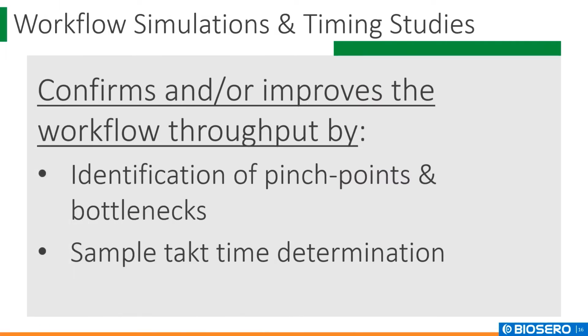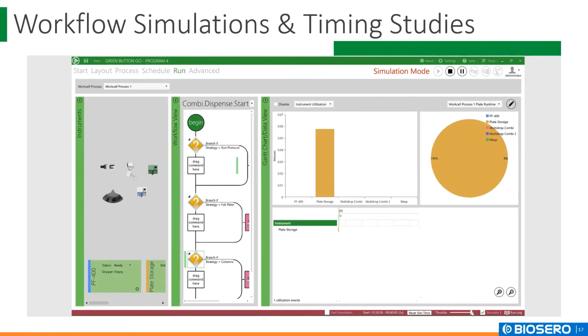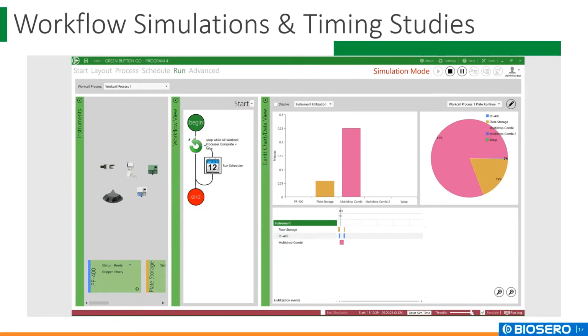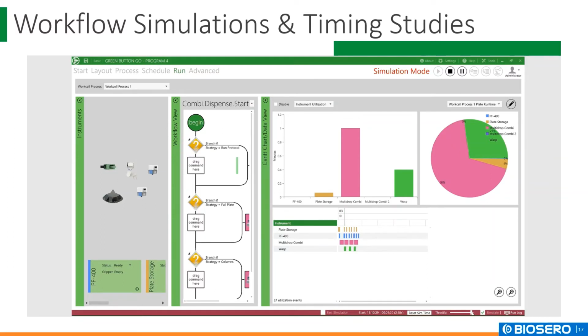If there are major concerns whether an existing design and its associated procedures of the automated work cell are able to meet the expectations, scientists will conduct a timing study of the intended workflow. The timing study is a simulation of the workflow based upon an agreed number of samples or time frame for testing. Collaborative determination of the time required for the completion of each step or instrument process of the workflow helps to avoid any oversight of detail that can impact the accuracy of the simulation.